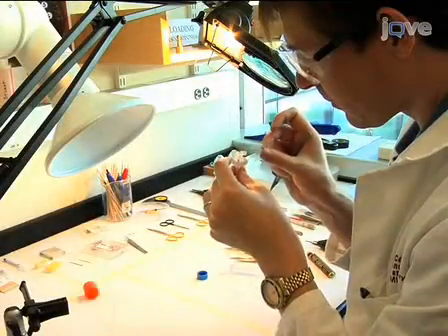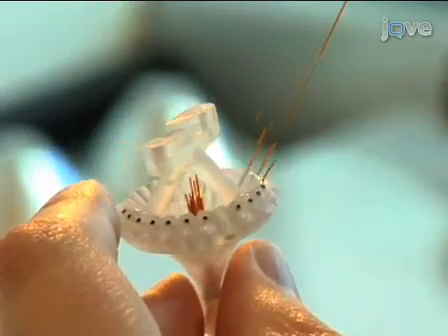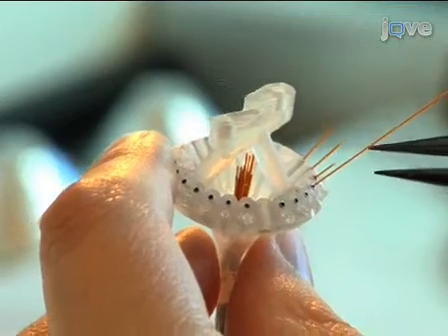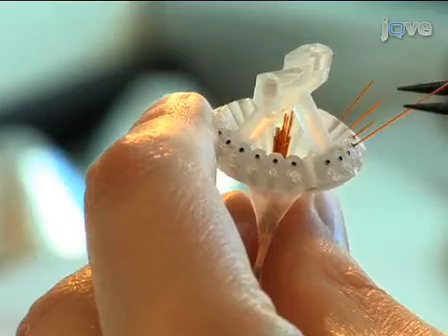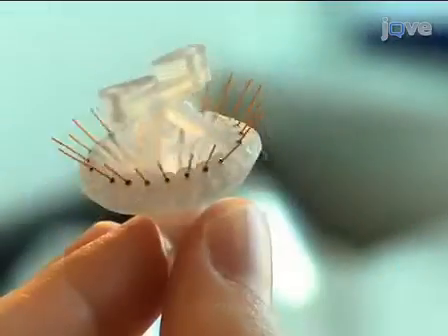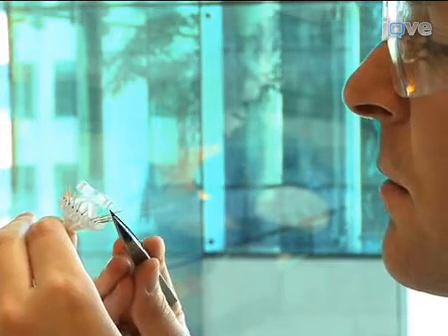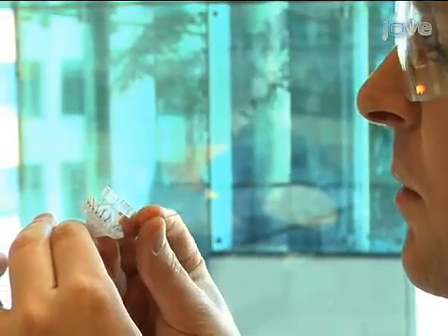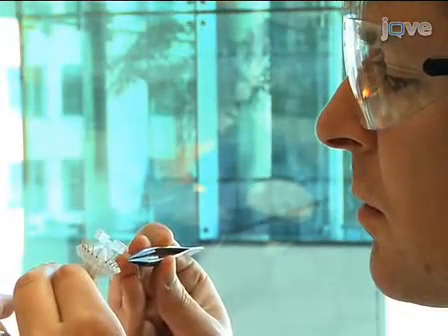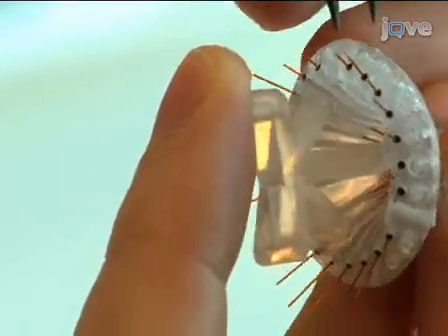Now remove each guide tube one at a time and feed it into one of the sleeves at the top of the drive. Pass the tube down through the gap it left behind in the bundle of tubes. Inspect the guide tubes for kinks or tight bends and replace as needed. Adjust each guide tube's position so it extends 1 to 2 millimeters from the top of the sleeve.